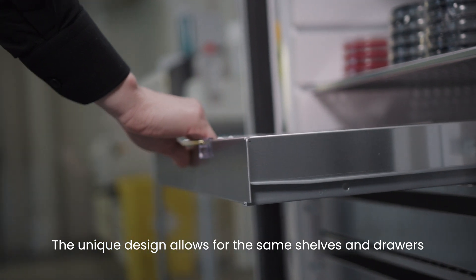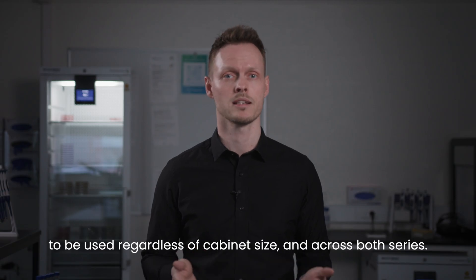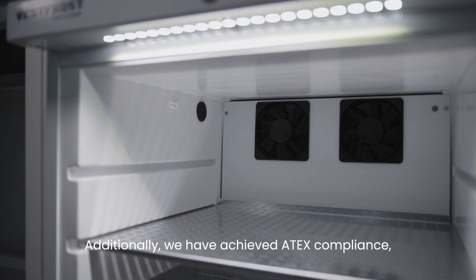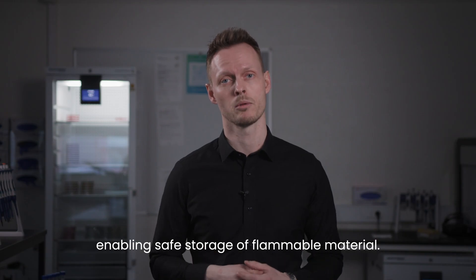The unique design allows for the same shelves and drawers to be used regardless of cabinet size and across both series. Additionally, we have achieved ATEX compliance, enabling safe storage of flammable material.